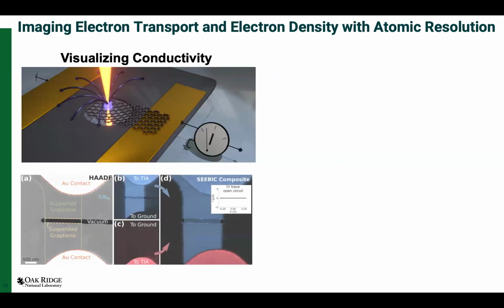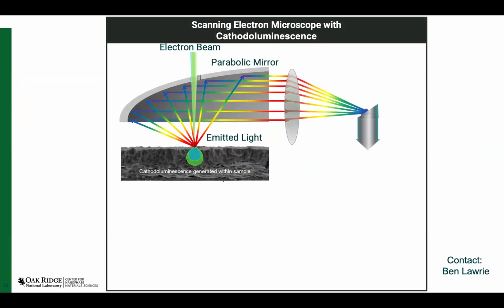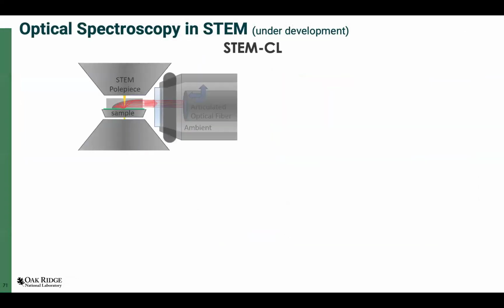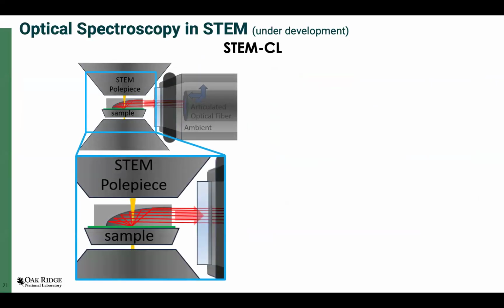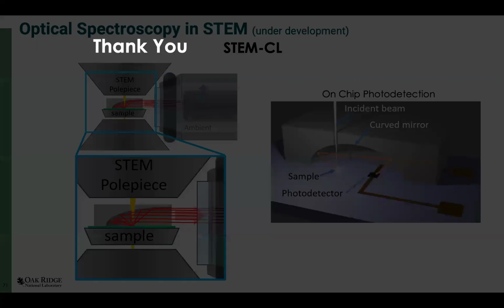And then finally, I won't do much on it other than to say that the electron microscope is a pretty good microscope too. And so we're coming up with ways to actually do measurements in the microscope. We can use the same kind of setup to use the electron beam to shine onto whatever defect we make. It's like a broadband electrical or optical excitation, or it behaves like that. And so you can get photons emitted from the surface, and you can study that. And so we can do optical spectroscopy with the electron beam, but at a much finer resolution, right? Atomic scale resolution, which is impossible with normal photons.